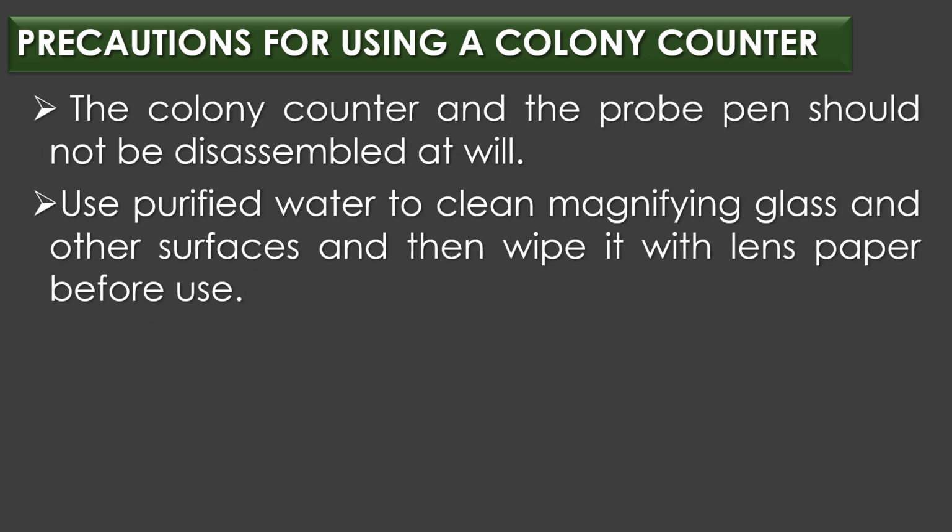The colony counter and the probe pen should not be disassembled at will. Finally, use purified water to clean magnifying glass and other surfaces and then wipe it with lens paper before use.